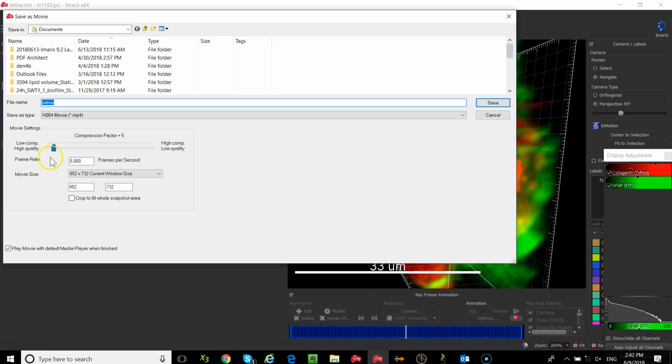If you touch that, especially if you drag it over to the right, it lowers your resolution. And so it will look pixelated and grainy. That was probably what happened. So keep it right where it is. Compression factor of 5 is the default, but that means that it keeps it a higher quality without making it too big. So we try and balance the two. Nice resolution, but not huge. So that might have been what it was right there.